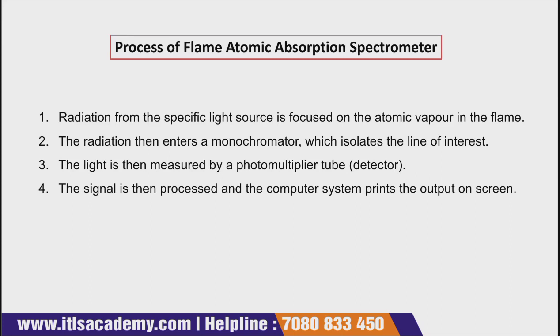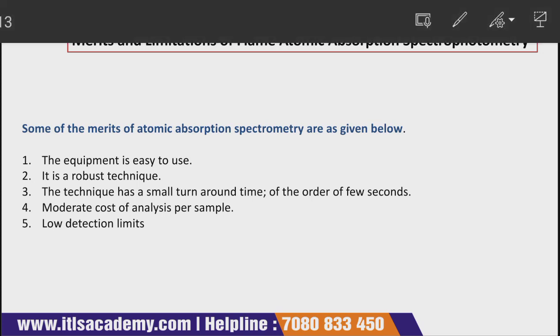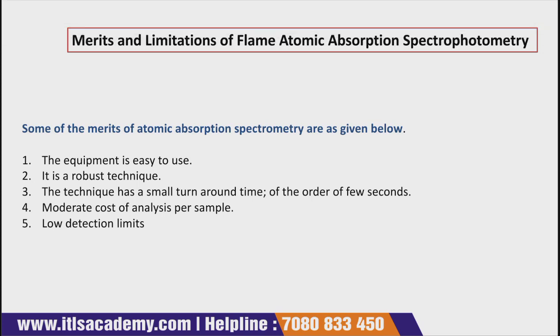Now moving further with the merits and limitations of flame atomic absorption spectrometry. Students, every technique, whether it's chromatography or spectrometry, has certain advantages and disadvantages.